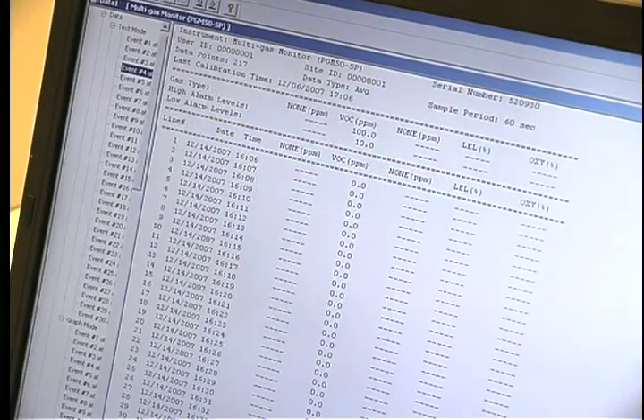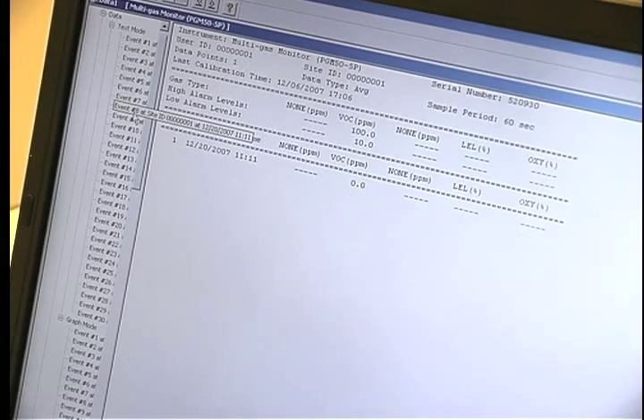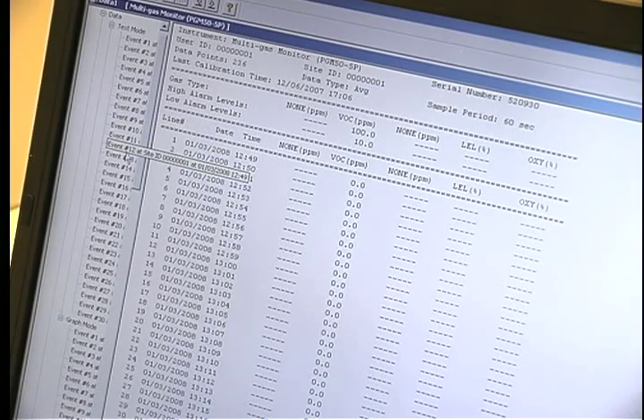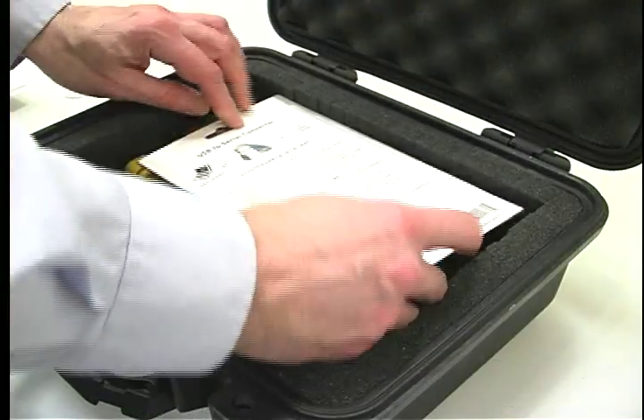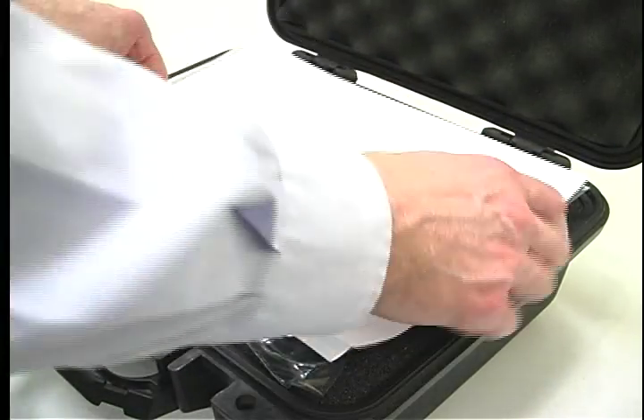You can choose the style and type of report you would like from the options available on the left. Name the file, then save or print the report. Exit out of the software, repack, and ship everything back to Galson Laboratories.